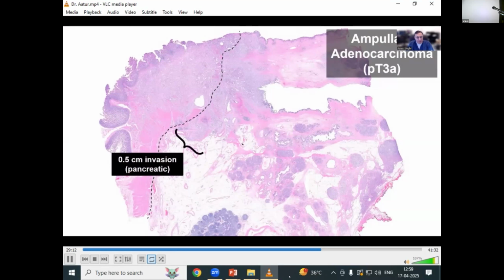Again, this can be facilitated by cutting along the pancreatic and bile ducts, as shown here, where you can get a nice ampullary cut, but only when you're cutting through the ductal system. Again, by probing it, opening up the specimen, bivalving it into two sections, and then getting nice cuts of the ampulla to show its proximity and its invasion into the pancreas, biliary system, and whatnot.